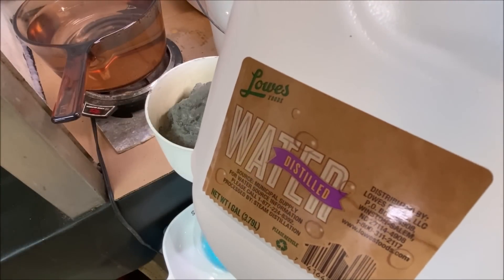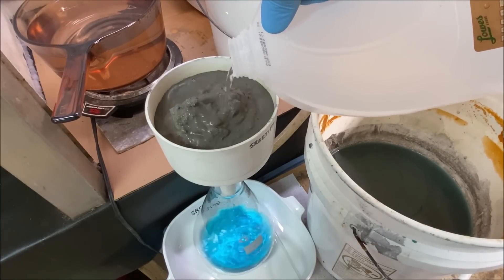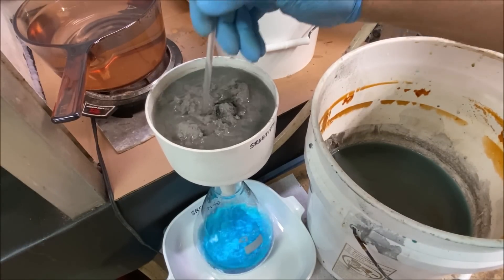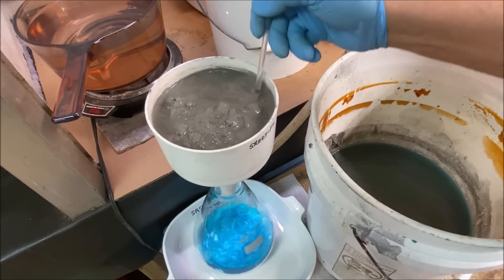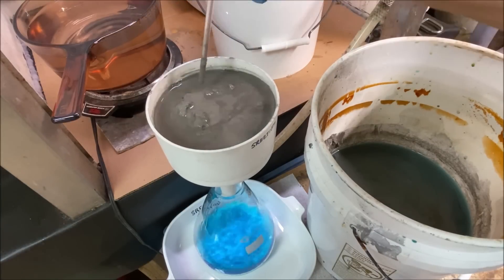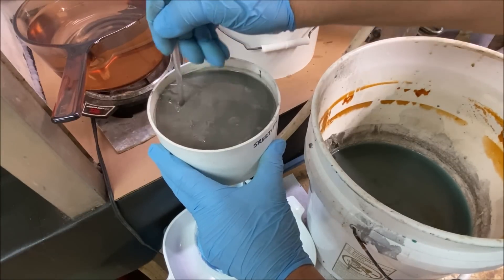Now I'm adding some distilled water. The goal is to try to get all the blue liquid rinsed off of our cement silver. I've got a little glass rod and I just stir it up as the water gets pulled through. I put two filters in there to protect against the filter tearing as I stir it.